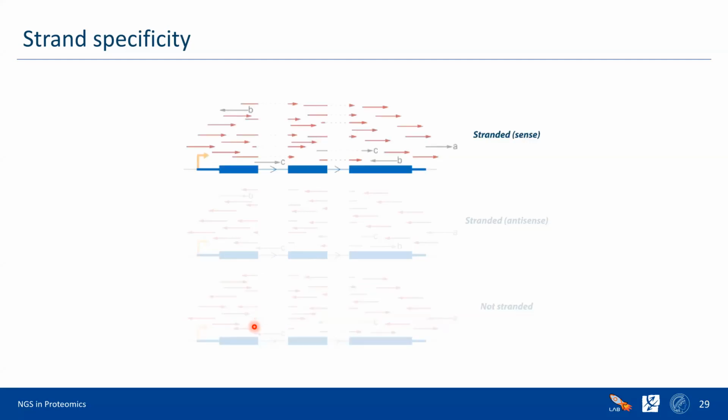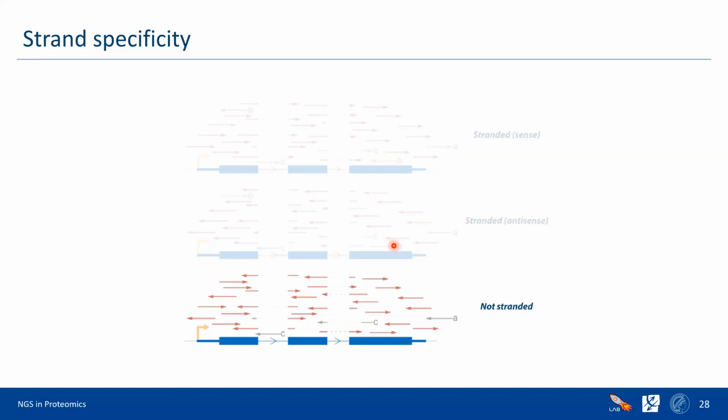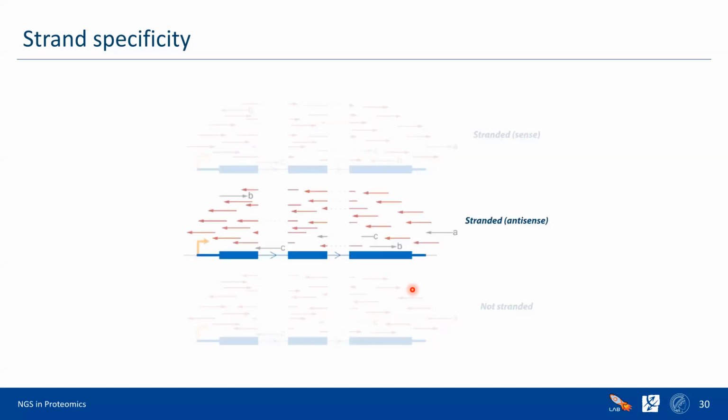But the current modern NGS transcriptomics standards are such that you can easily make a stranded library and sequence in a stranded way, preserving this information, and also antisense, so stranded but in the other direction. Honestly, in almost 99% of the cases I see, non-stranded would be totally enough. If you don't know which strand, just use non-stranded, just use the default, and there's not going to be any problems.